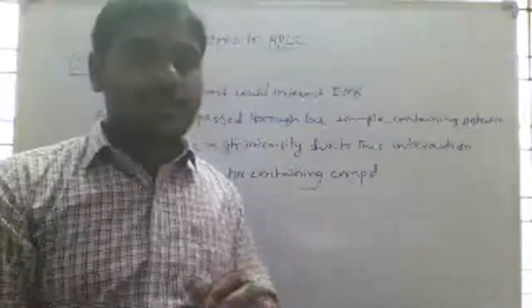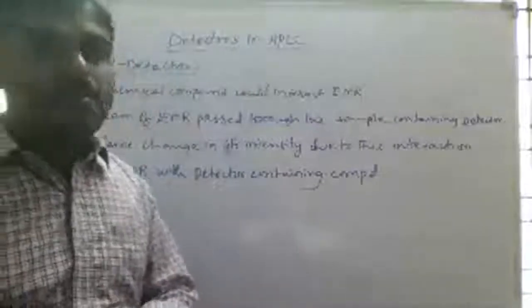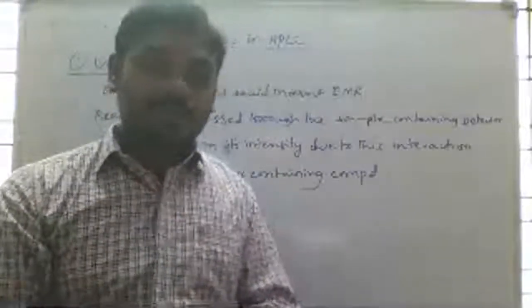The outcoming transmitted light radiation is somewhat different. So this change is the basis for most of the optical HPLC detectors.